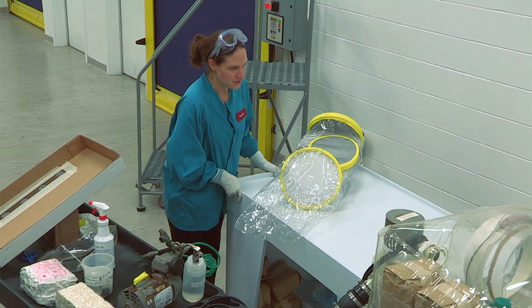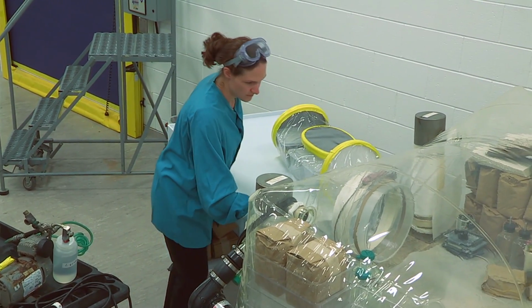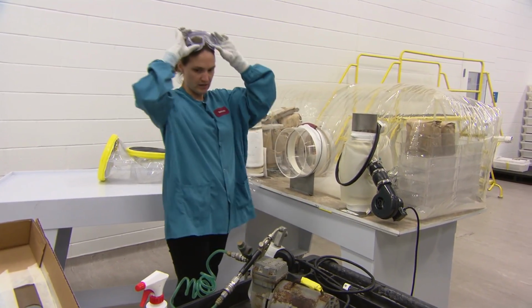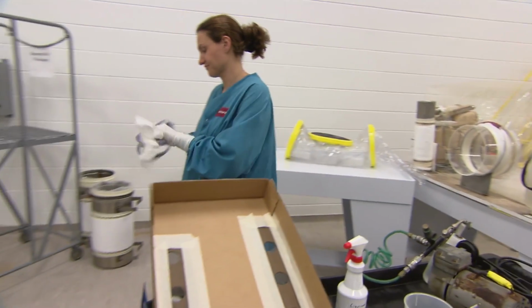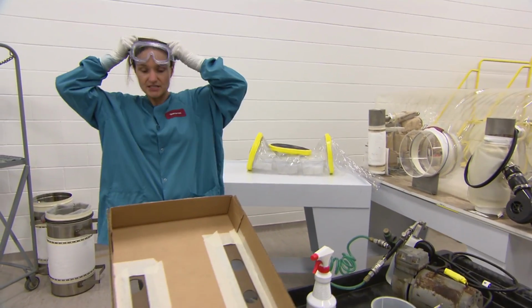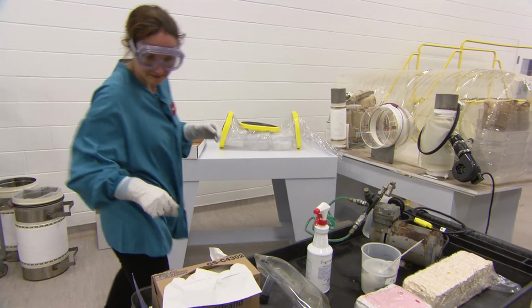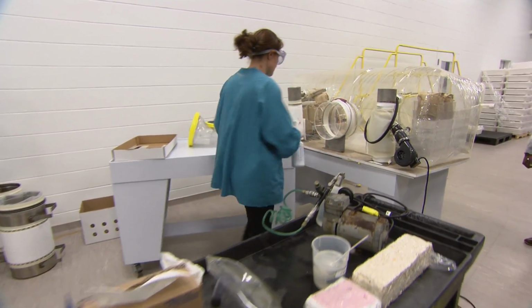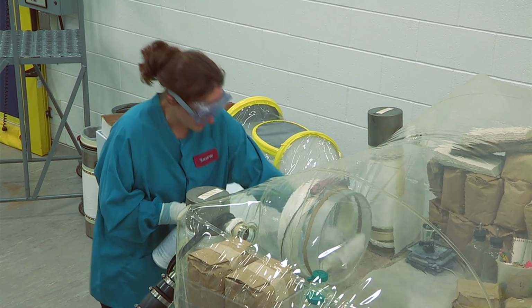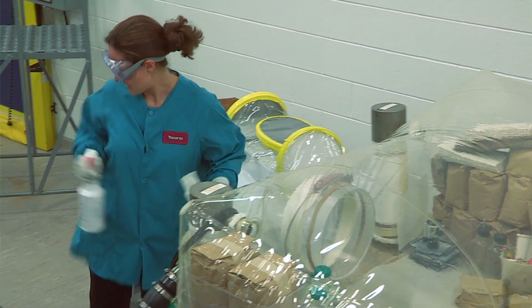Okay, so once we've determined that our shipper is ready to go, put it up here. It's very similar to our cylinder. Now, if you have any debris that's in the port, what we recommend is just spraying a paper towel with some sterilant and then wiping out your port, just to get any bedding or debris that might be in there out of the way. So again, we'll spray our port, directing our spray towards the periphery, and then take the sprayed towel and clean out our port and spray again.